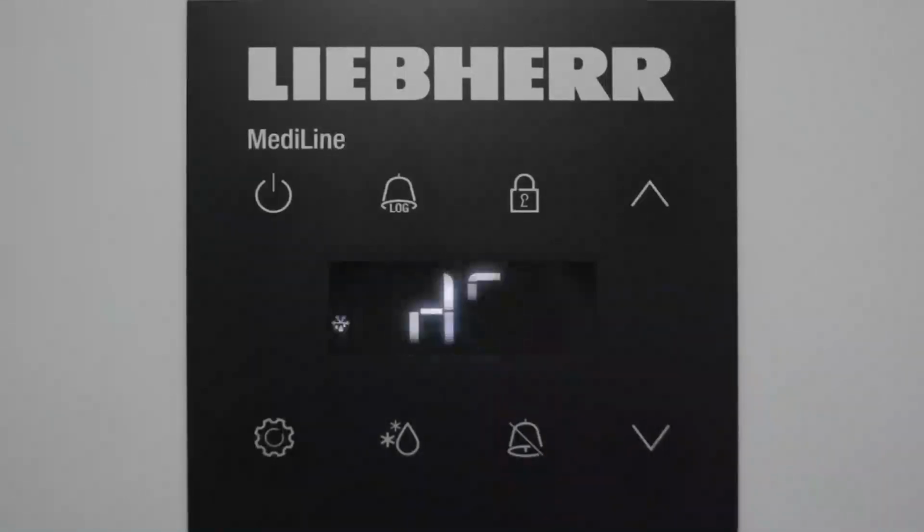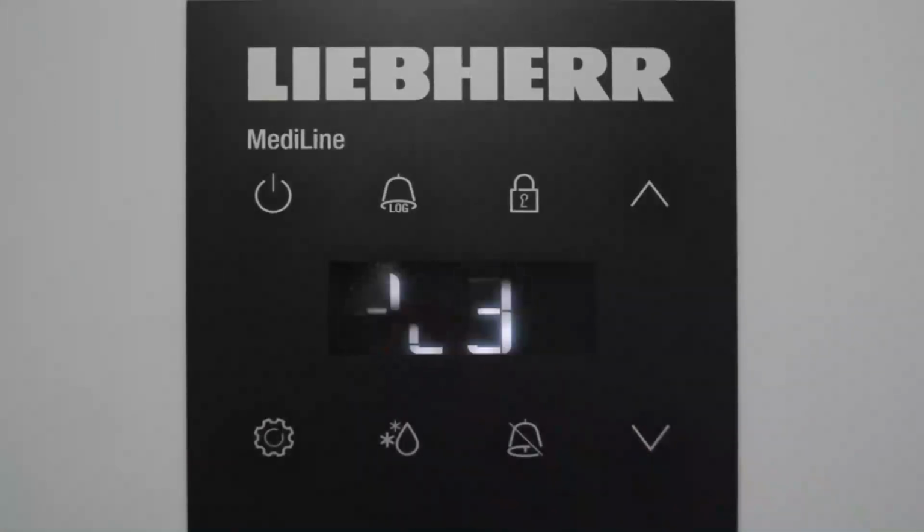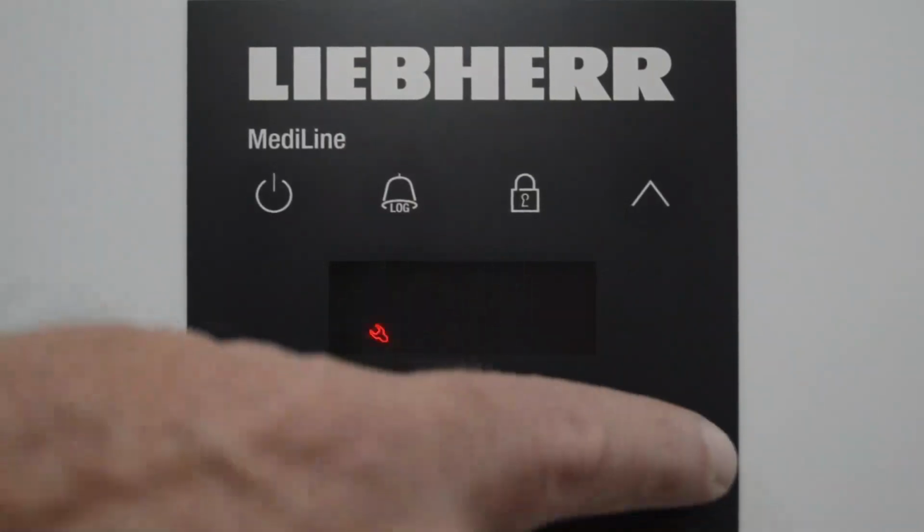There are 4 more settings we will go past. One more down will give /C3. That is to calibrate a product sensor. That's a secondary sensor that you may put into the device and wish to calibrate. /C1 is calibrating the control sensor, which is the sensor that runs the device itself. All Liebherr biomedical equipment is already pre-tested at a 9-point calibration test at the factory before dispatching, so there will be no need to calibrate your appliance from the start. So I'd bypass that.